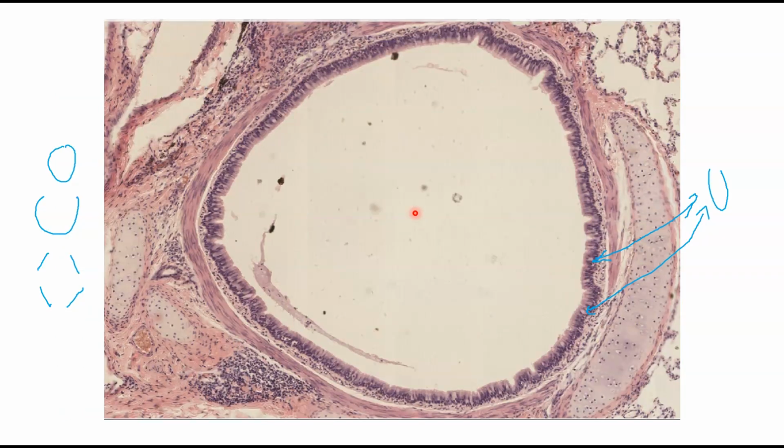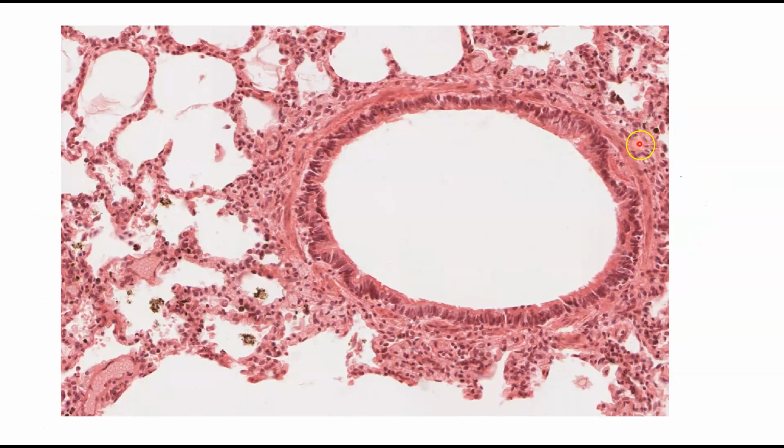If you remember our bronchus, and who could forget it, the bronchus is very circular in structure. It's got the pseudostratified columnar epithelia, it's got smooth muscle, it's got plates of cartilage. Look in here, there's one structure that mimics that very well, and that's this bad boy right here, a bronchiole. So a bronchiole is still going to have our pseudostratified columnar epithelium. You can see the little wispy hairs there a little bit. It's getting a little harder to see, but they're still there. You can definitely tell that the nuclei are at all different levels. So this is going to be that pseudostratified columnar epithelium.